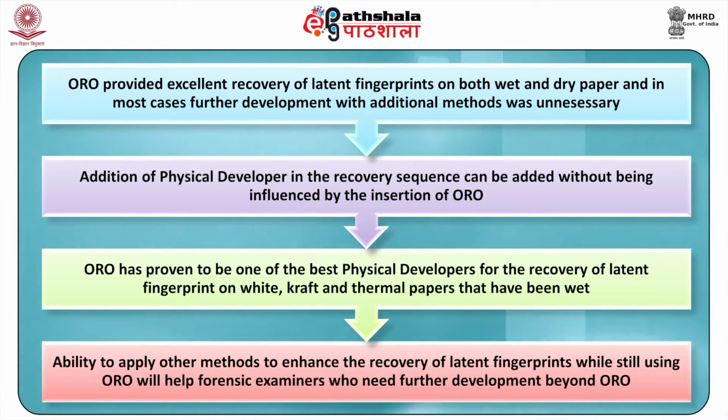The ability to apply other methods to enhance the recovery of latent fingerprints while still using ORO will help forensic examiners who need further development beyond ORO.